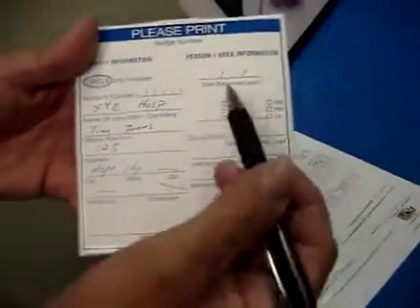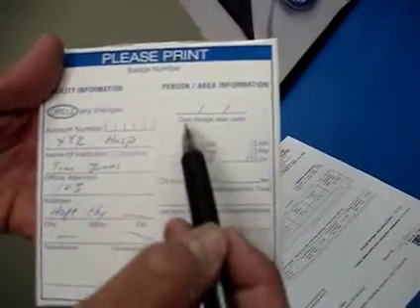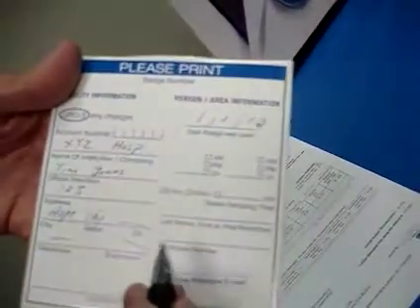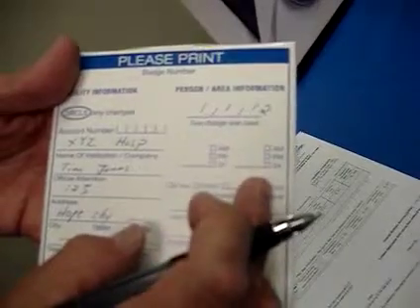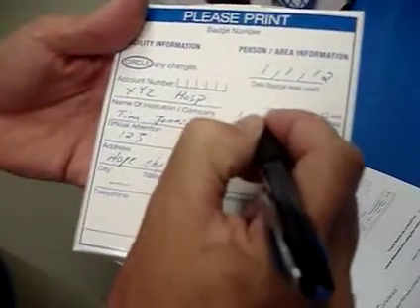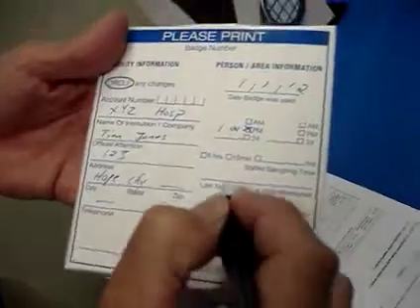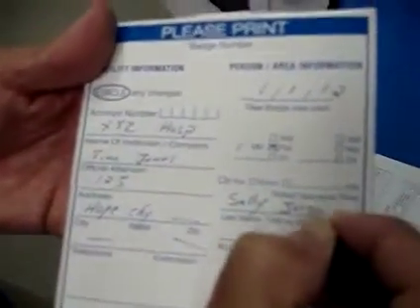This area here will change each time you use the badge. So the monitoring badge was used on this particular day. So let's say today is 1/1/12. And you'll want to note the start time and the stop time. It's very critical that we know exactly how long you use the badge for analysis. So let's say it's 1 p.m. is when we start. The person's name that's using the badge is Sally Jones.